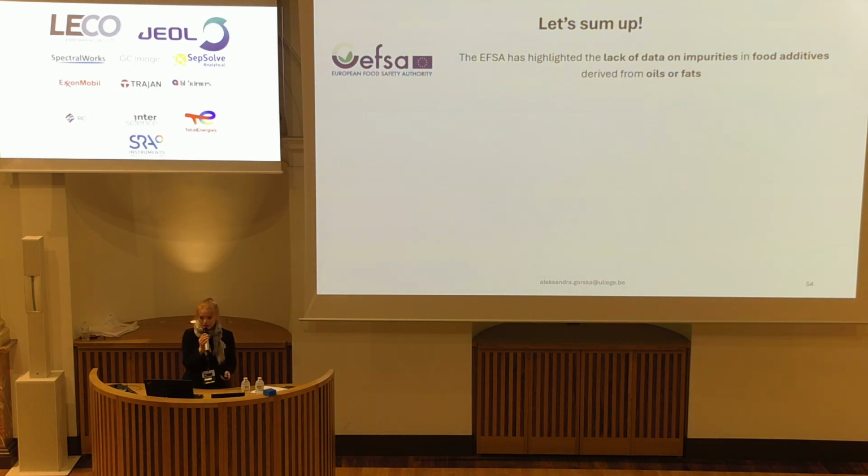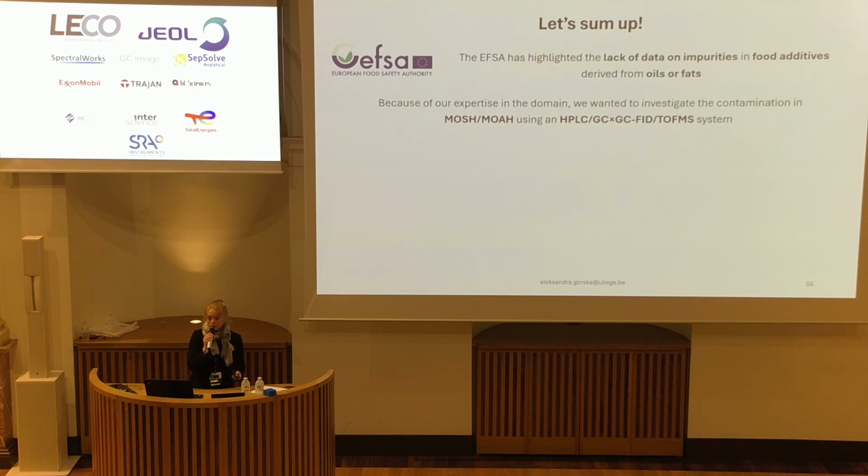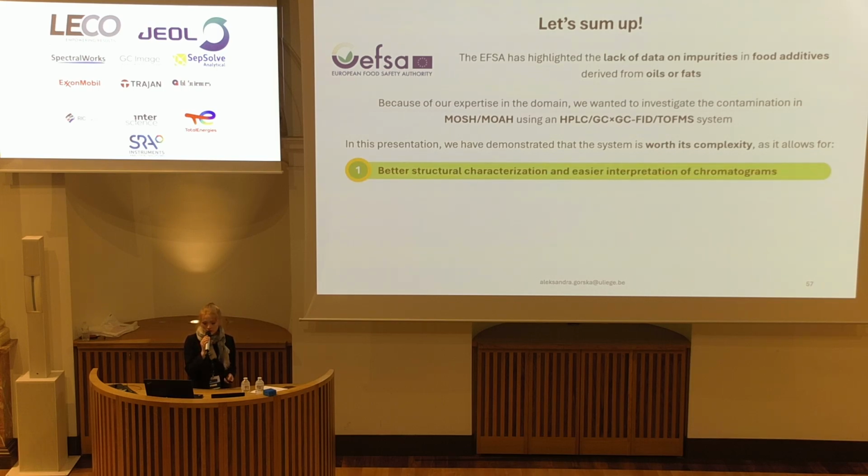The EFSA has highlighted the lack of data on impurities in food additives derived from fats and oils. So because of our expertise in the domain, we wanted to investigate the contamination in MOSH&MOAH using an HPLC GC-GC system with a dual FID TOFMS detection. In the presentation, we have demonstrated that the system is worth this complexity as it allows for, first, a better structural characterization and easier interpretation of chromatograms, and this not only because of the higher resolution of GC-GC, but also because we can physically separate the interfering compounds and the 1, 2, and 3+ ring MOAH using the HPLC.